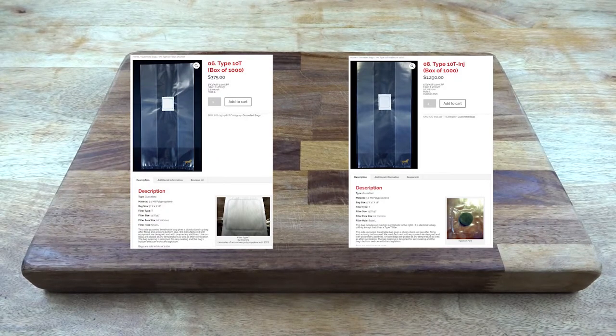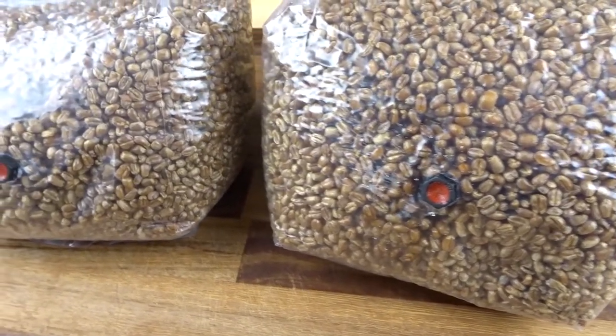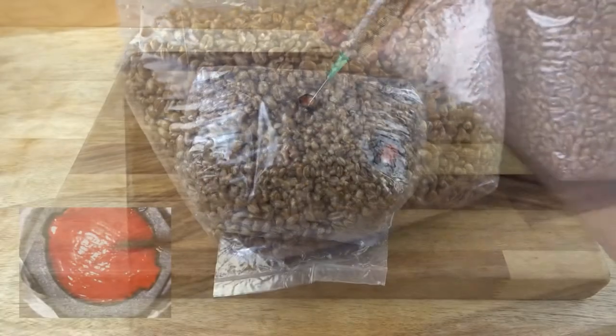Grow bags with injection ports are expensive, averaging around four to six times the cost of regular bags for that little bit of rubber. Injection ports allow the safe injection of a liquid culture or spores into a sterile environment of grain or substrate.